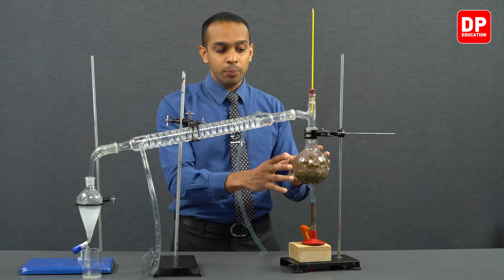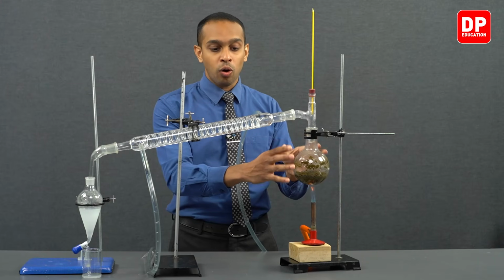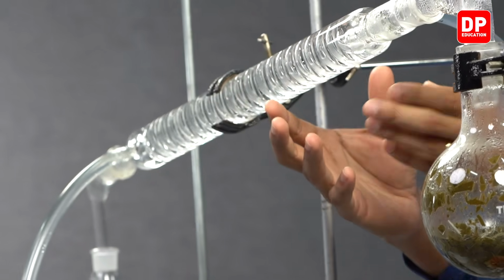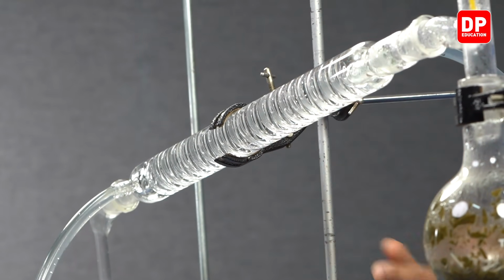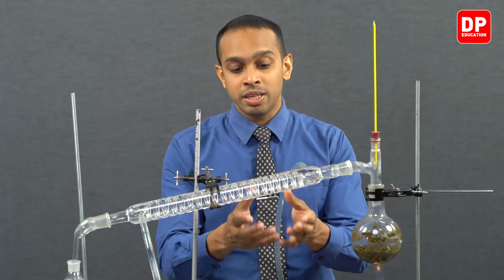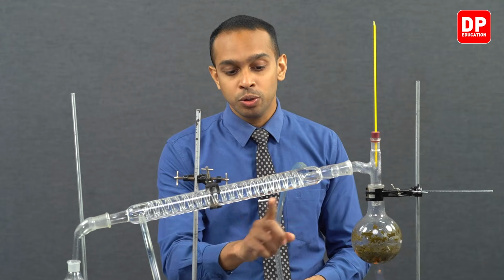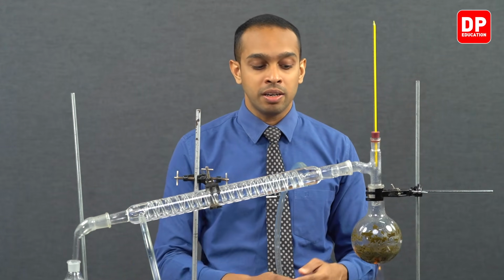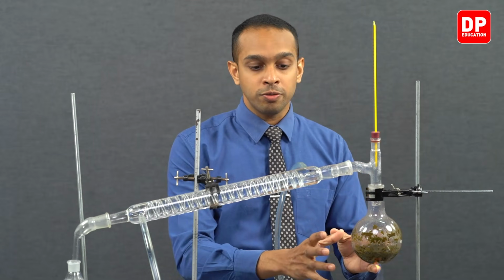As we heat this up, both water vapor and essential oil vapor will come into the condenser, and when they reach a temperature way below their boiling points, they will turn into a liquid, as you can see here. So this liquid should be collected into our separatory funnel after we take the heat source away from the round bottom flask.